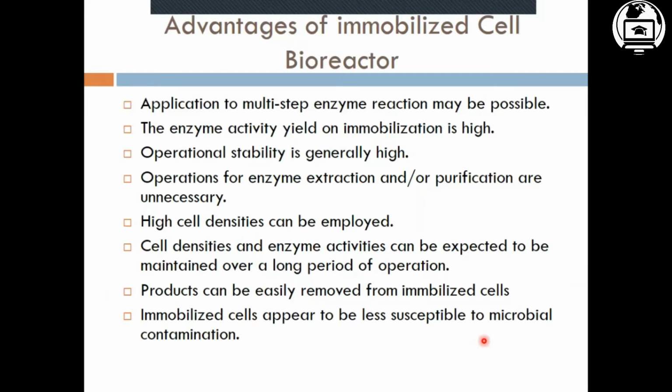So up till now, that is enough. Advantages of immobilized cell bioreactor: application to multi-step enzyme reactions may be possible.